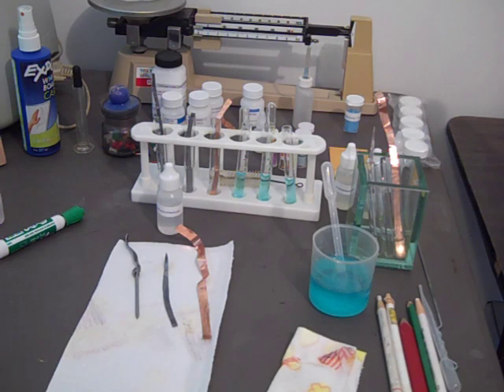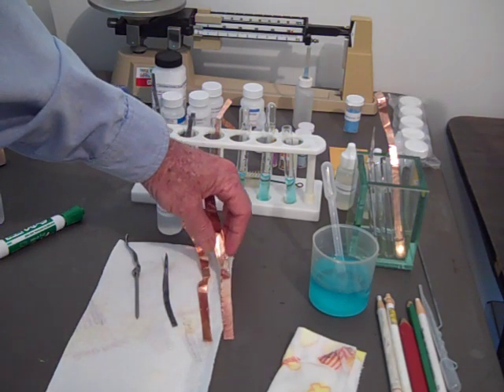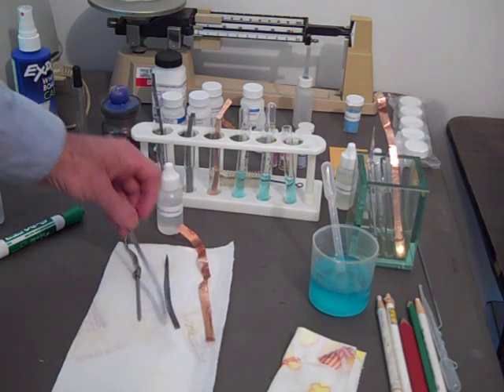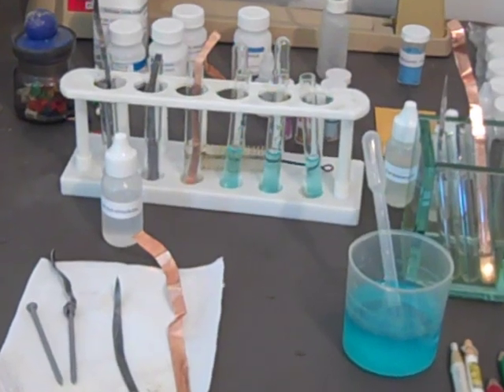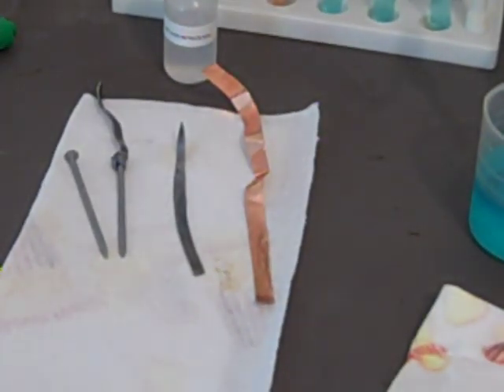We'll compare them with the bright copper. It hasn't been treated at all. And the lead, you can see the lead has really changed. And the galvanized nail, there's some darkening on the galvanized nail. Not much. So we're going to write that in. I'll give you a close-up first, how close we can get without losing focus here. So you can see those.